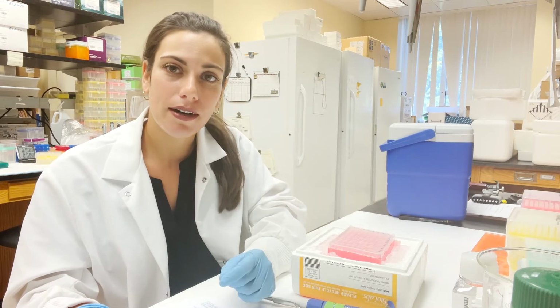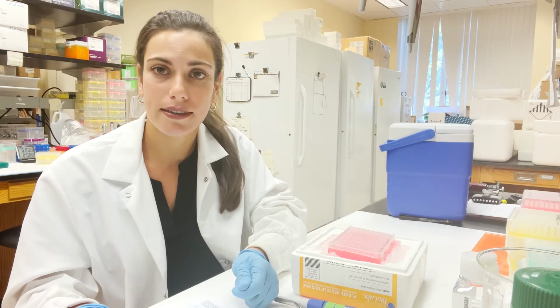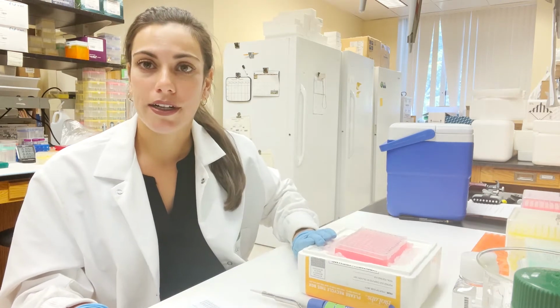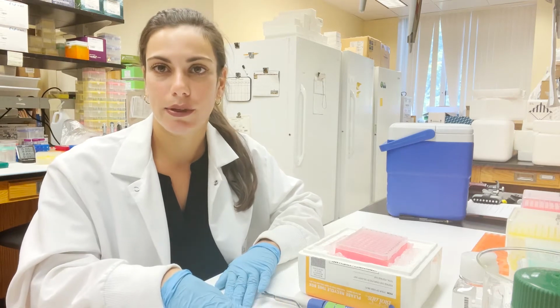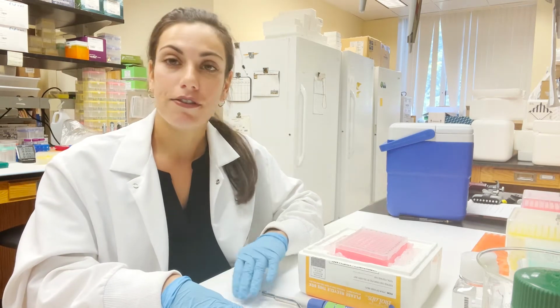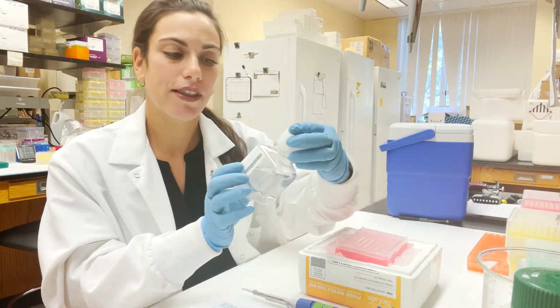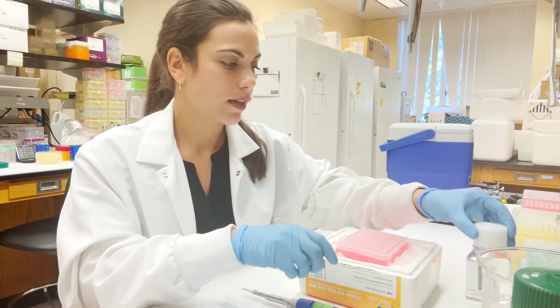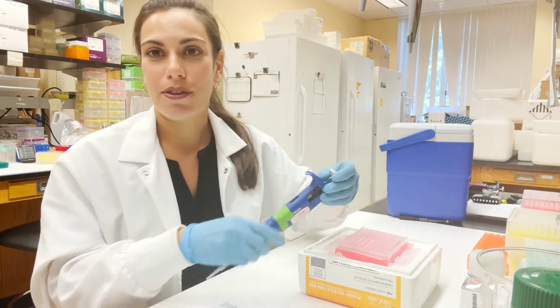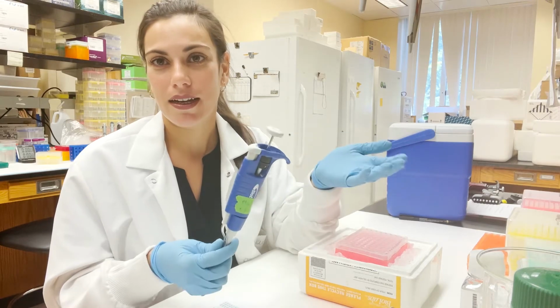Now, the hardest part of GBS is staying organized and paying attention and staying focused. When I add the water and the DNA, I'm constantly talking to myself and saying exactly what I'm doing in my head as I do it. The first step that I'll do is add all of the water. I make sure that it's DNase and RNase free. And really now the biggest holdup is changing all of the numbers on my pipette. Let's get started.